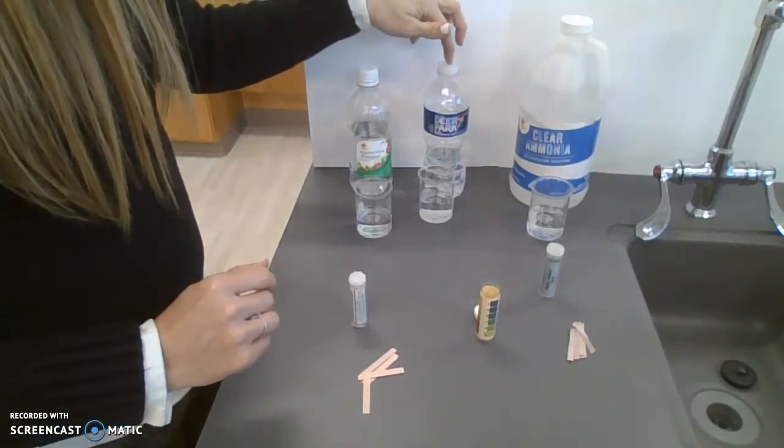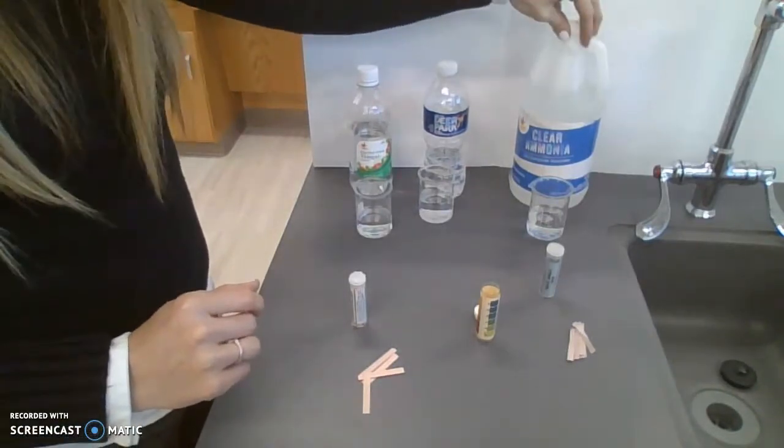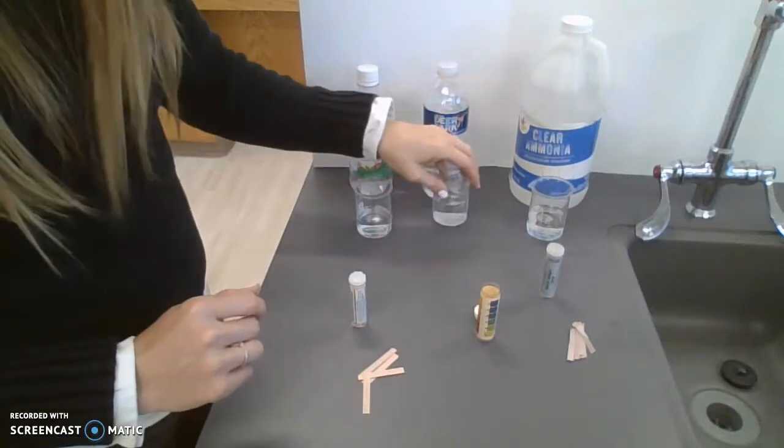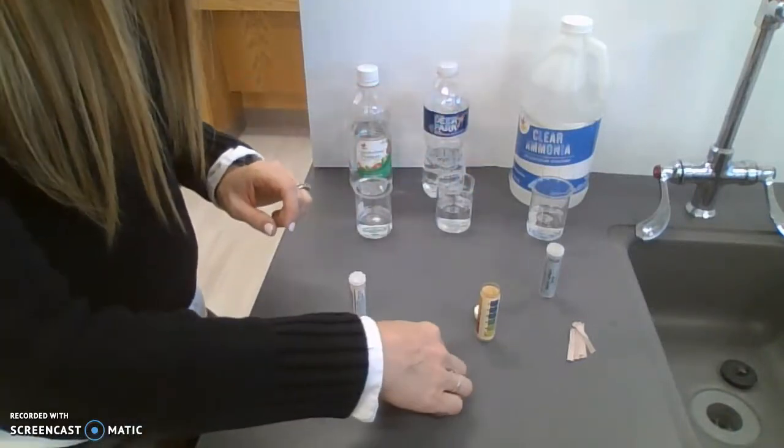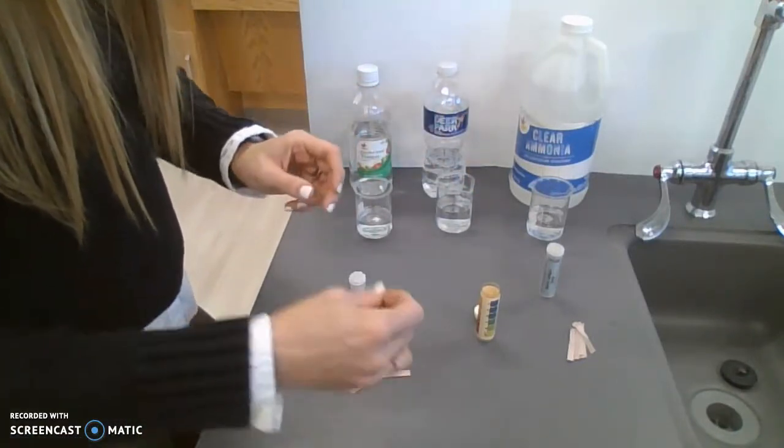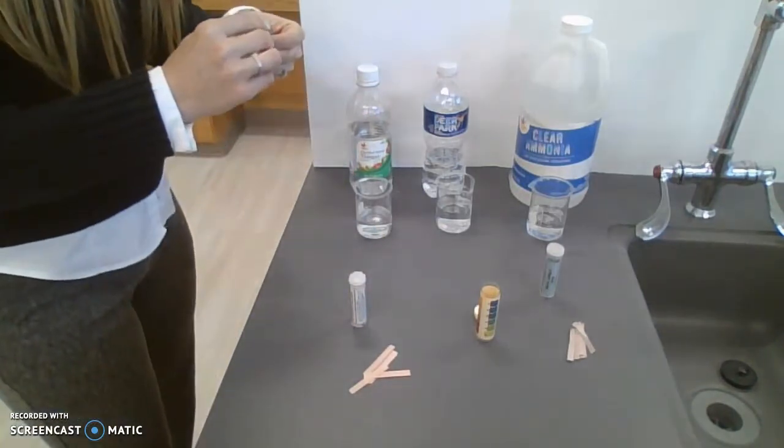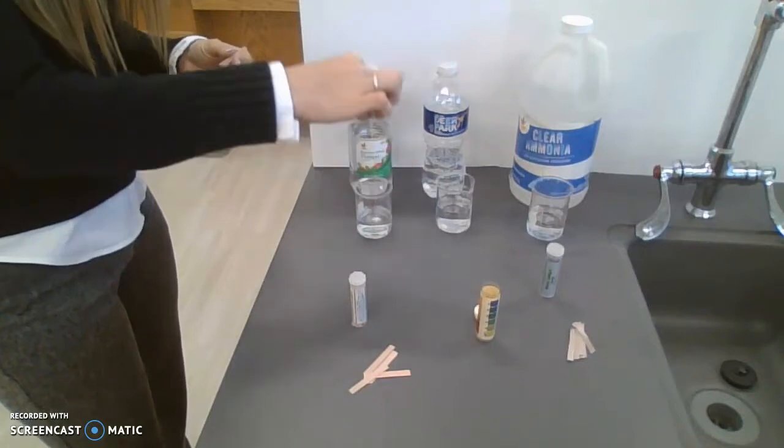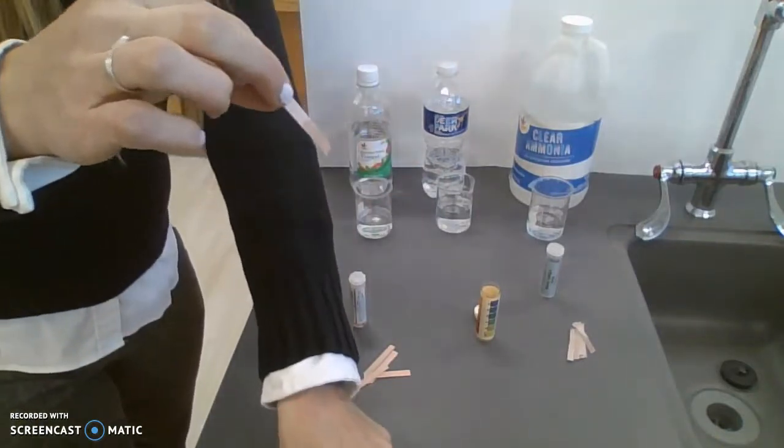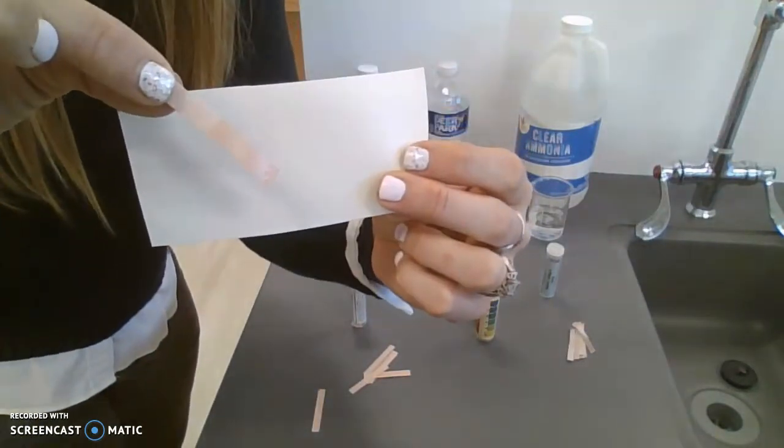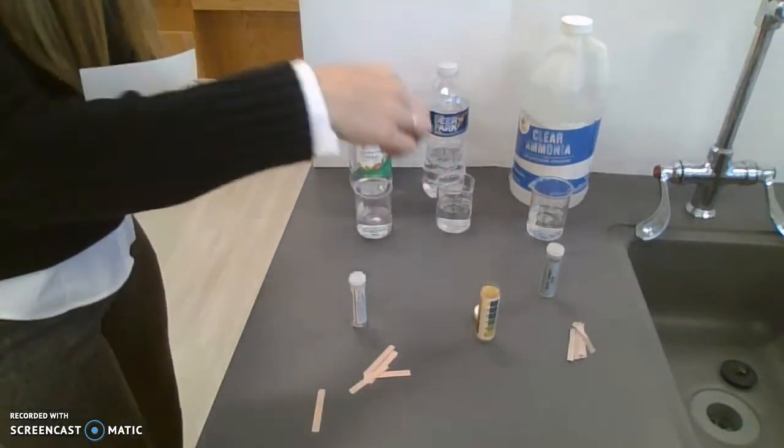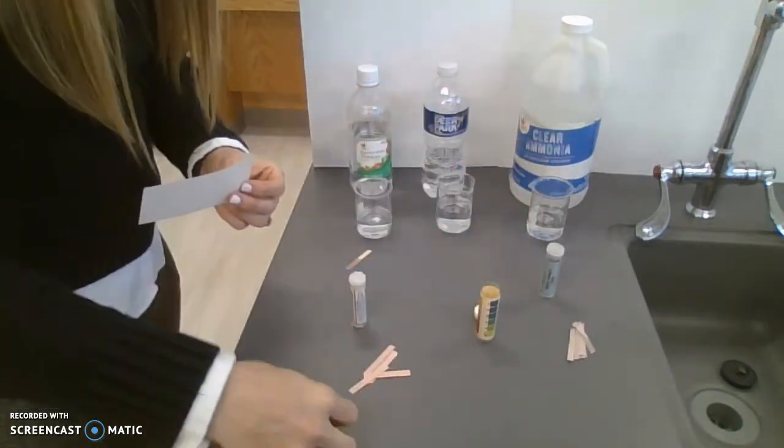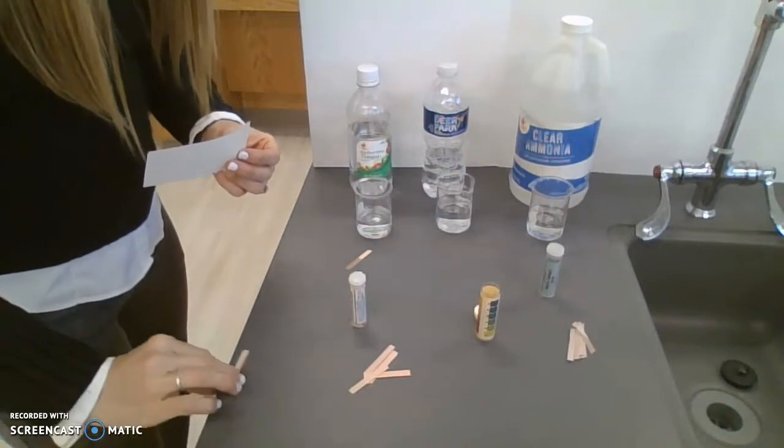Okay, litmus turns red in the presence of an acid. With red litmus paper in acids like vinegar, it doesn't really appear to do much; it just mainly looks wet. But you'll see when we test blue litmus paper that it does change.